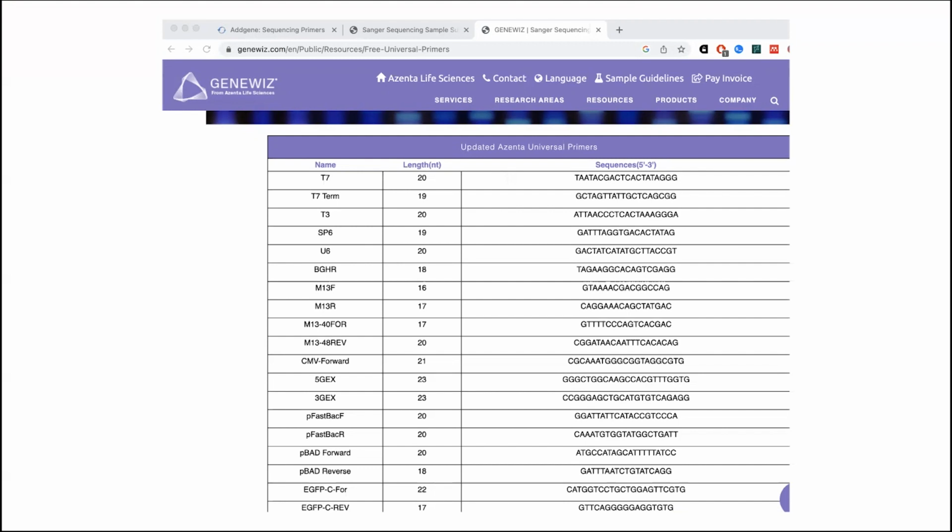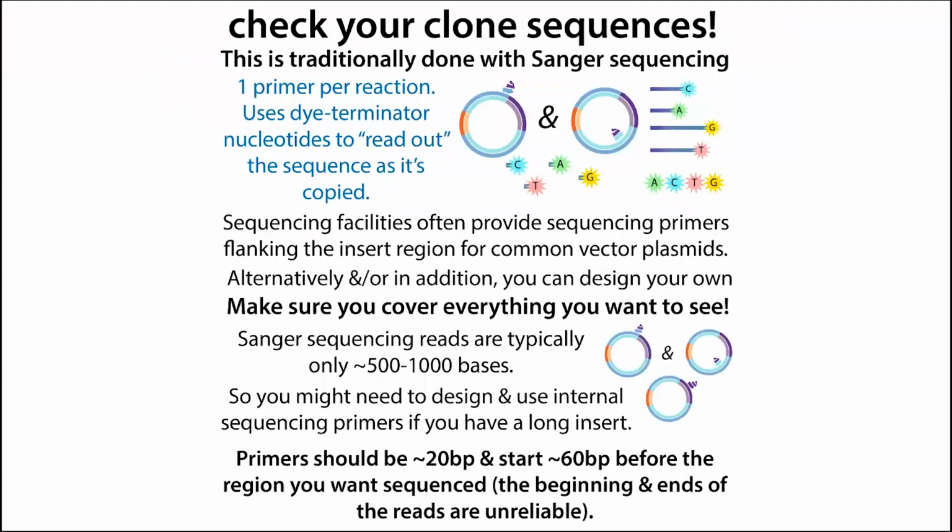Whereas if you want a custom primer, then typically you pre-mix it in with your vector when you send it for sequencing. Typically you do a mini prep, purify out the plasmid, measure the concentration, and dilute it to whatever amount the company wants. Then you either mix in the primer you want to use, or you tell them to use the general primer they already have. Then you print out an order form, bubble wrap your sample up, and stick it in some sort of sequencing pickup box.